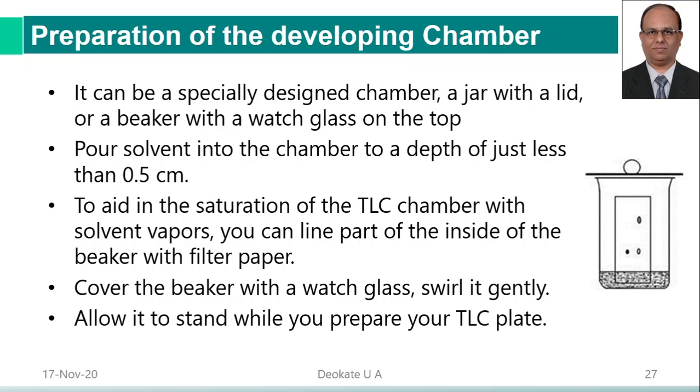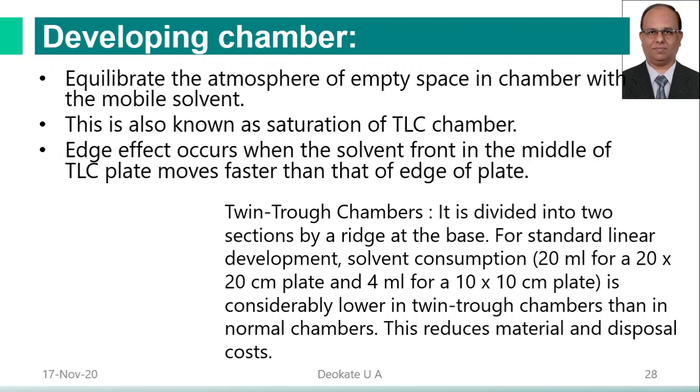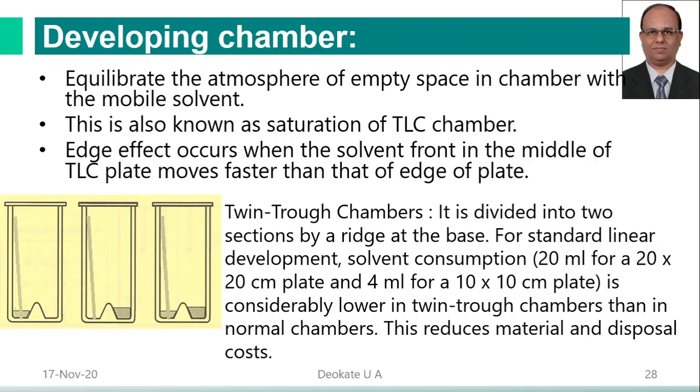saturation of the TLC chamber with the solvent vapors. You can line part of the inside of this beaker with filter paper so that you will get maximum saturation. Cover the beaker with a watch glass, swirl it gently, and allow it to stand while you prepare the TLC plate. This will take a saturation period of 30 minutes to 2 hours. So equilibrate the atmosphere of the empty space in the chamber with the mobile phase. This is also known as saturation of the TLC chamber.